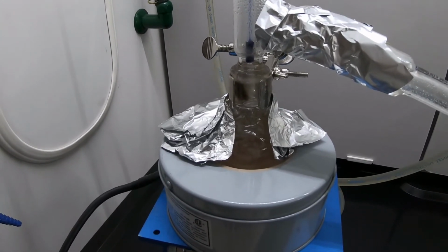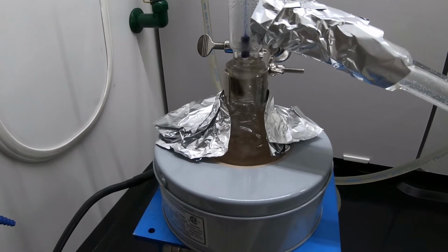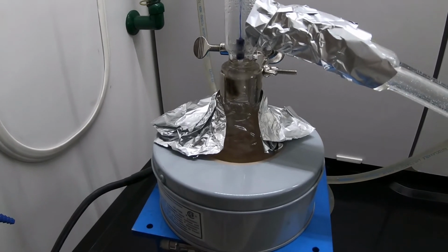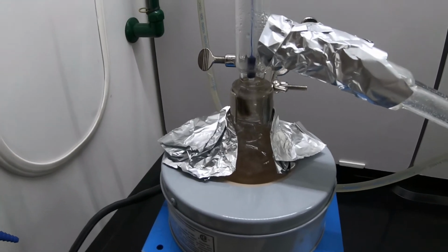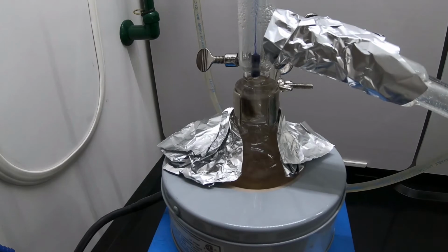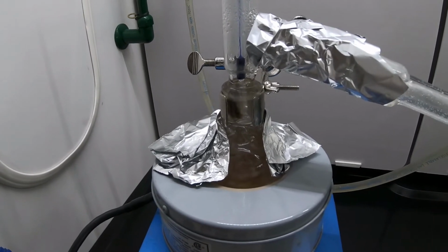Boiling is vigorous, but not out of control, so just to encourage the reaction, I am not going to lower the heat on the variable transformer. I'm going to keep it where it is. And you can see the boiling chips. I'm not sure if you can see it with the camera. I can see it. The bubbles are forming very nicely on the boiling chips, which is encouraging smooth, vigorous boiling and not bumping.